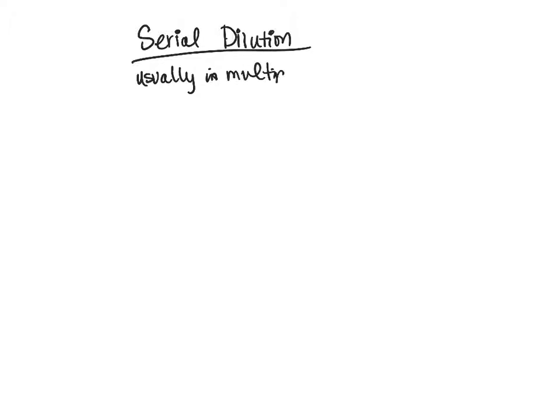The way that we are going to get a plate that has between 30 and 300 colonies is by doing something called a serial dilution. In a serial dilution, we take our sample and dilute it one right after another, so serial, meaning a series. Once we do that, we're going to have various percentages. We usually do this in multiples of 10, so that it is simple math, and easier to back calculate, which we'll talk about in a moment.